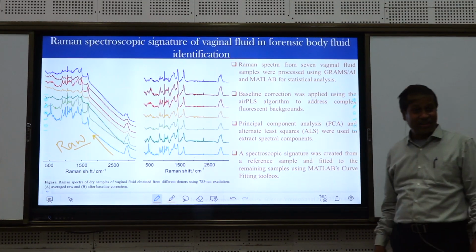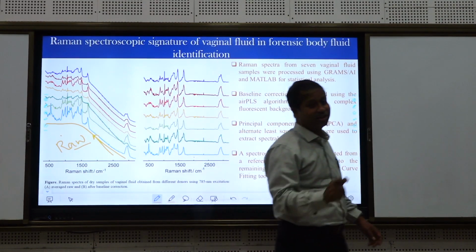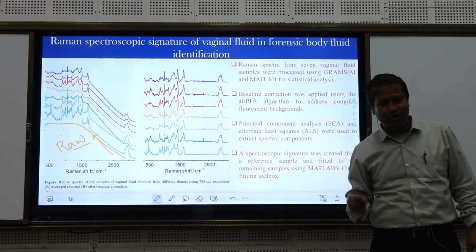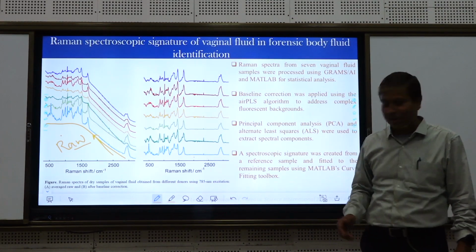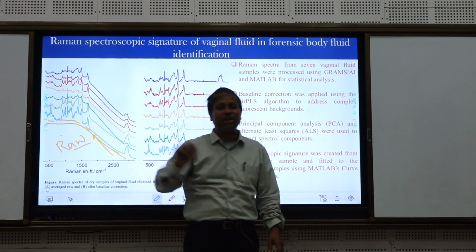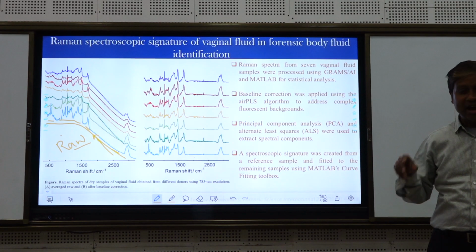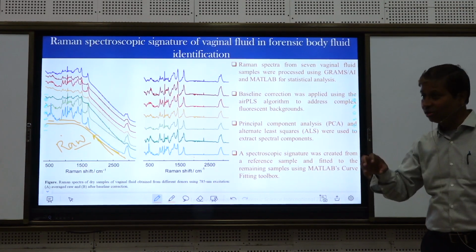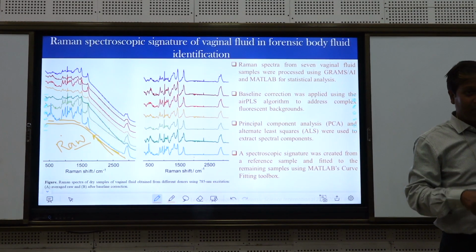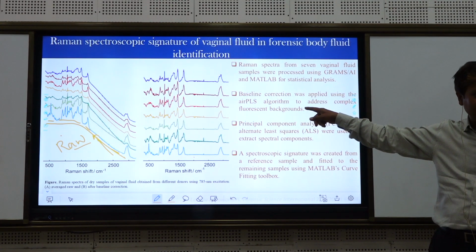See, so much change. And baseline correction is not just that you correct this much baseline. That has some mathematical significance. Whatever polynomial you are using, why you are using that polynomial is not just that you select it like that and then deduct it. It should have meaning. That is why there are some groups who do only this, and based on their work, those kinds of formulations will be there in your machine program, which allows you to do this kind of operation.